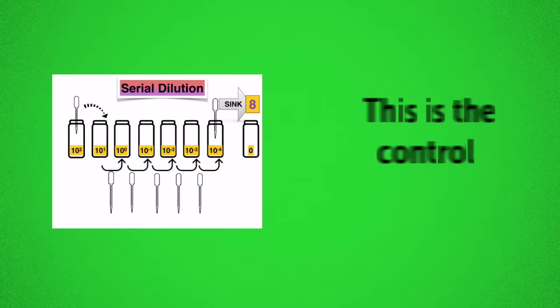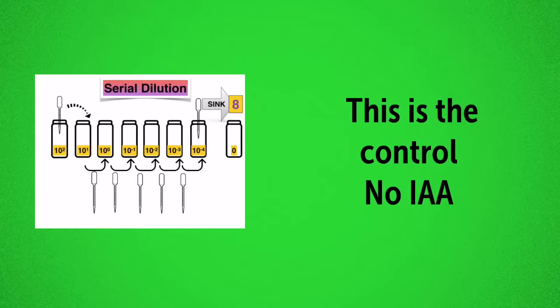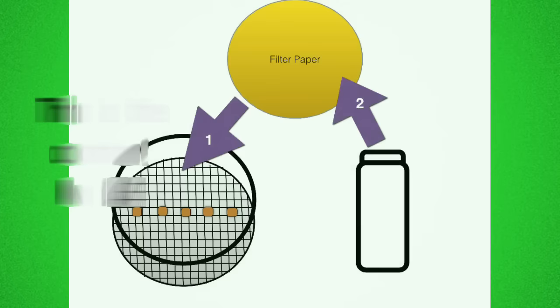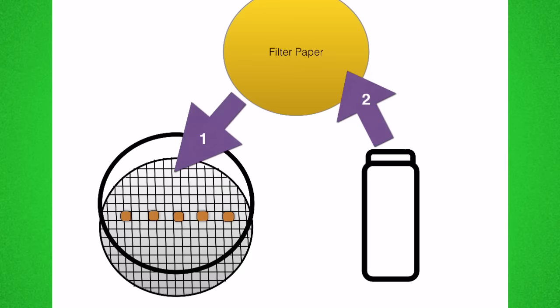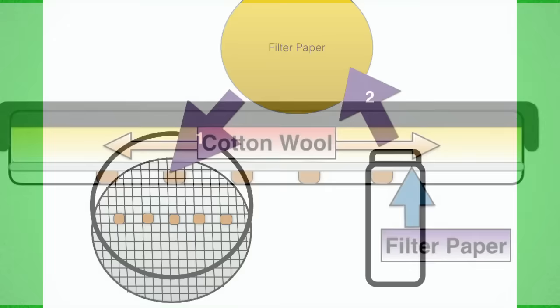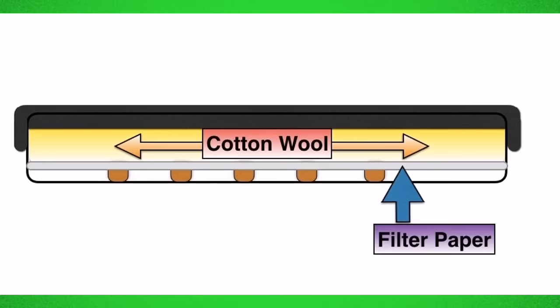Each of the bottles now contain nine mils of liquid and the last bottle, bottle number eight, should only contain nine mils of distilled water. This is the control. Each bottle was matched with a petri dish. Into the petri dish was placed a piece of filter paper which was only slightly dampened with some of the bottle contents. On top of the filter paper was placed cotton wool and the remainder of the bottle contents was placed onto the cotton wool soaking it.